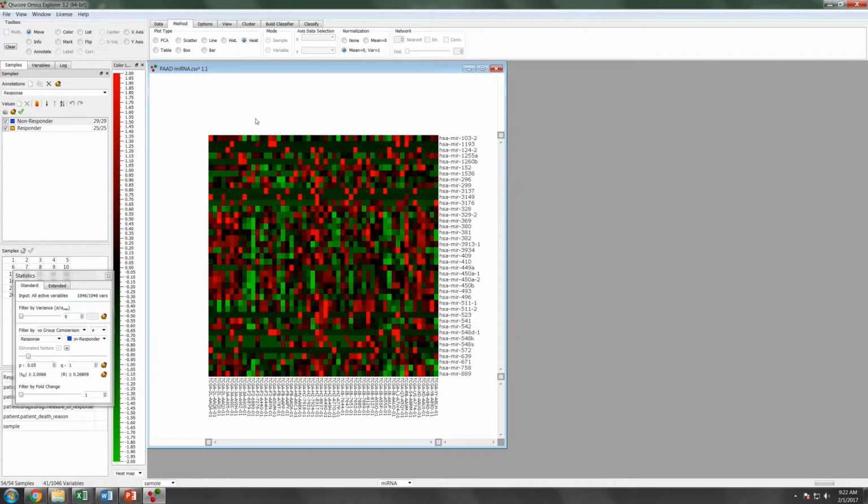You can read out how the heat map looks like. Of course, here it is now random, basically.